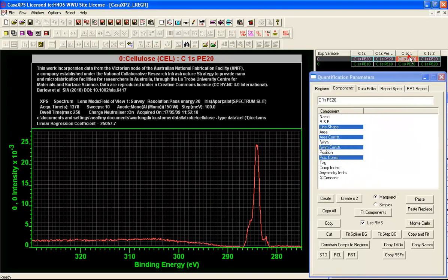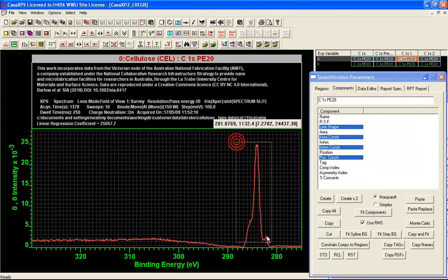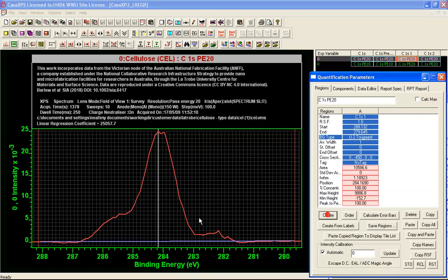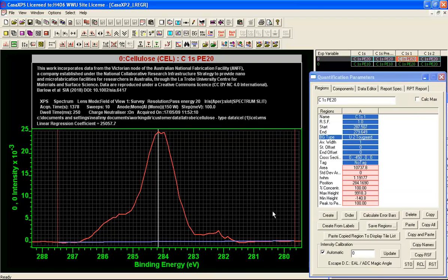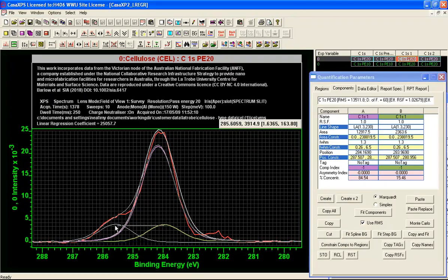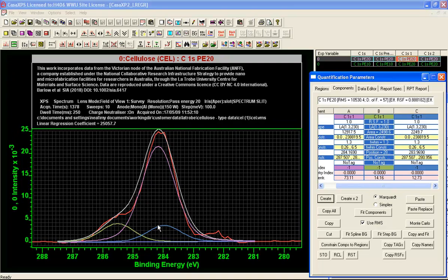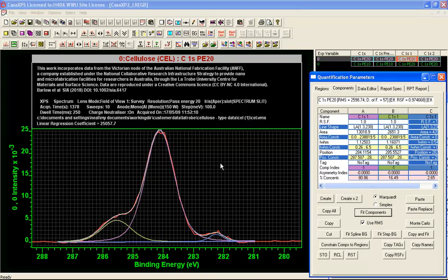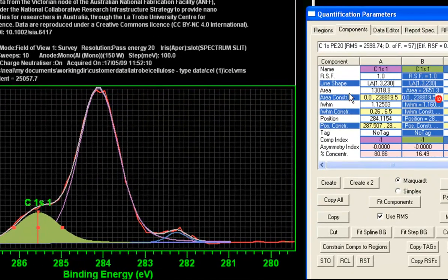Whereas for the other spectrum, again simply putting in a fit based on, let's say in this case 3 peaks, and say fit, well, we've ended up with a pair of peaks here that might be deemed to be in the right proportion.